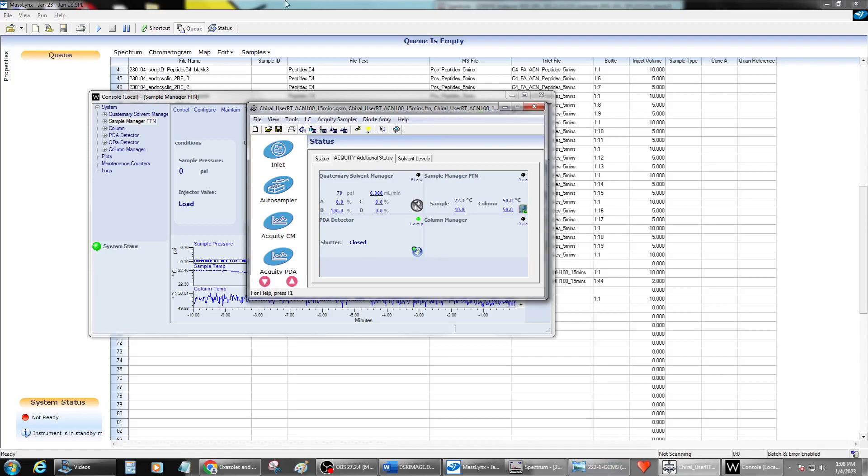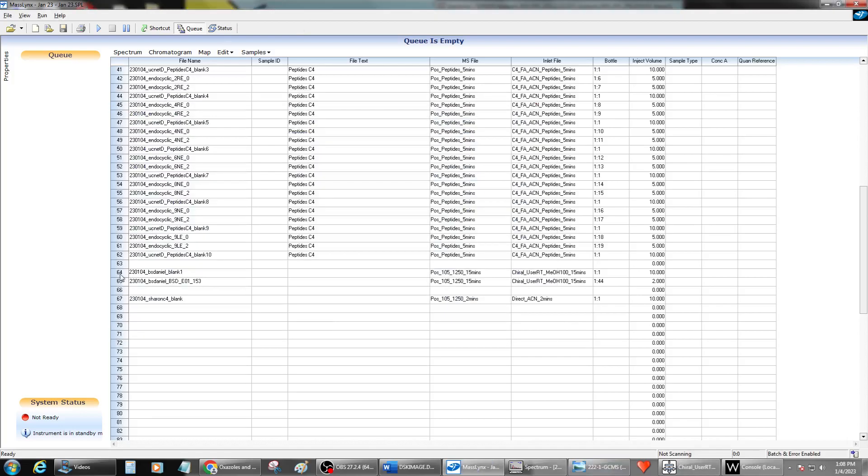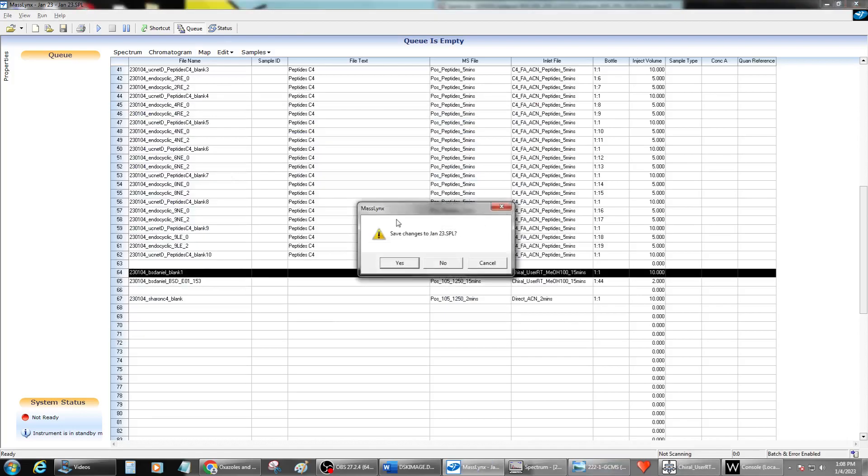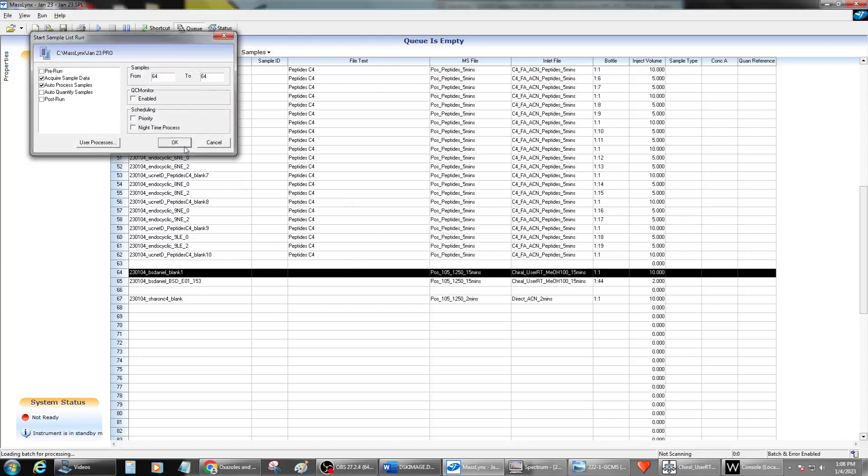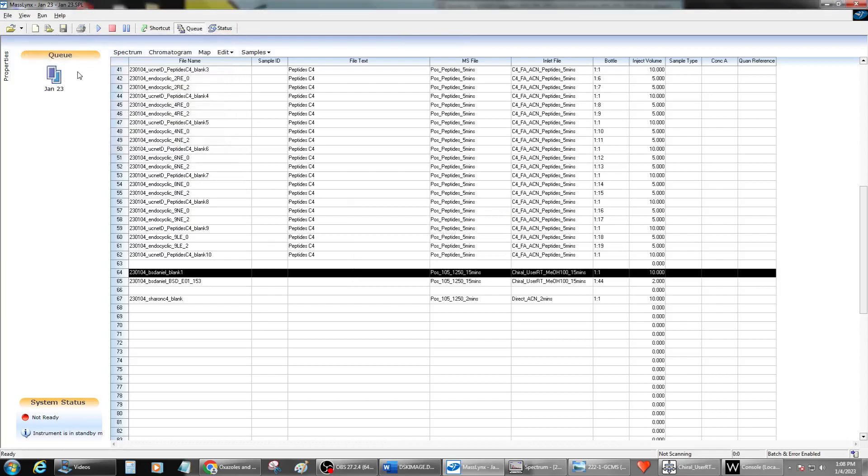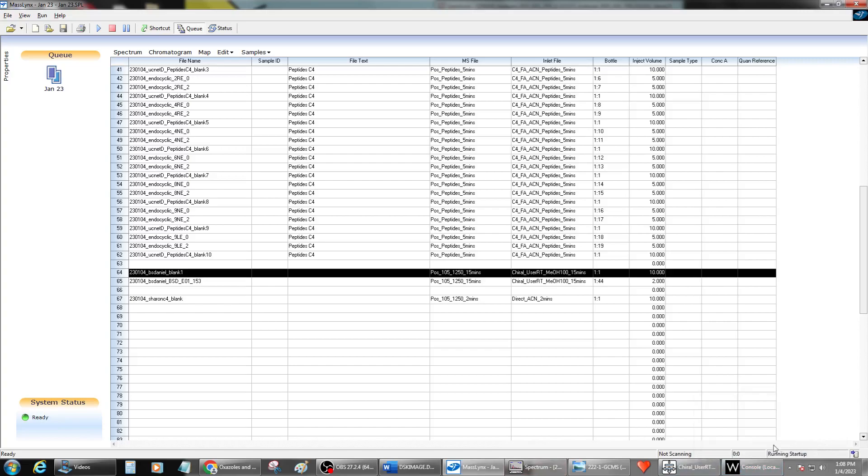And then I will just go ahead and change this file name here. I'm going to hit play. And yes, I'm going to go ahead and put it into the queue. And we'll hear the instrument turn itself on and run its automatic startup here in the corner.